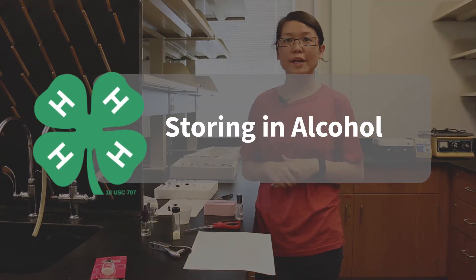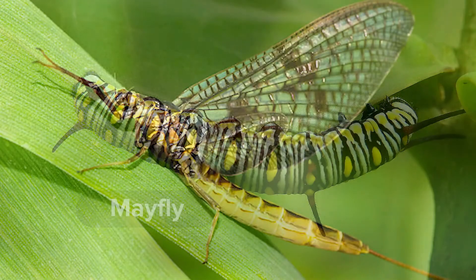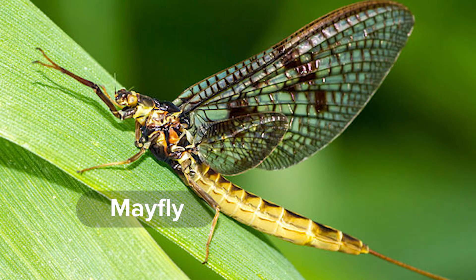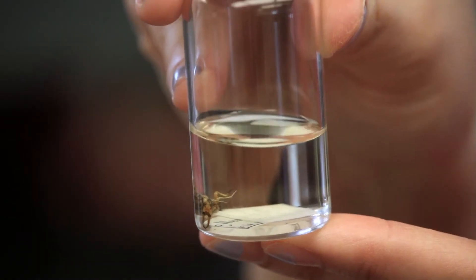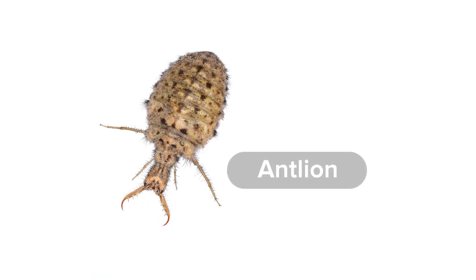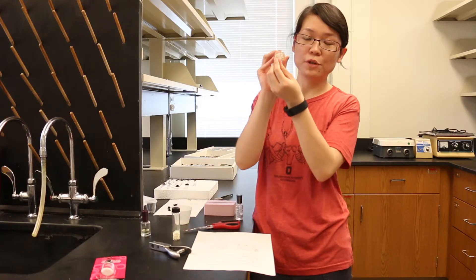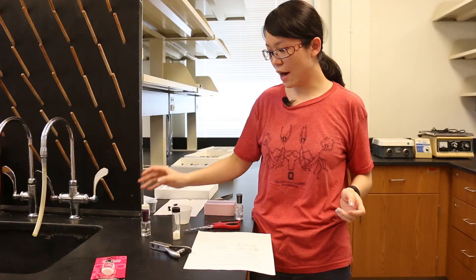Finally, the third way to preserve an insect is to store it in alcohol. For soft insects such as caterpillars or other larvae, we normally just store them in a small vial or container with 70% alcohol or rubbing alcohol. Remember to keep the label inside the vial, and always write your label in pencil. Here is an example of a larva stored in 70% alcohol, and on the bottom we have similar labels written in pencil so the alcohol doesn't wash it off.